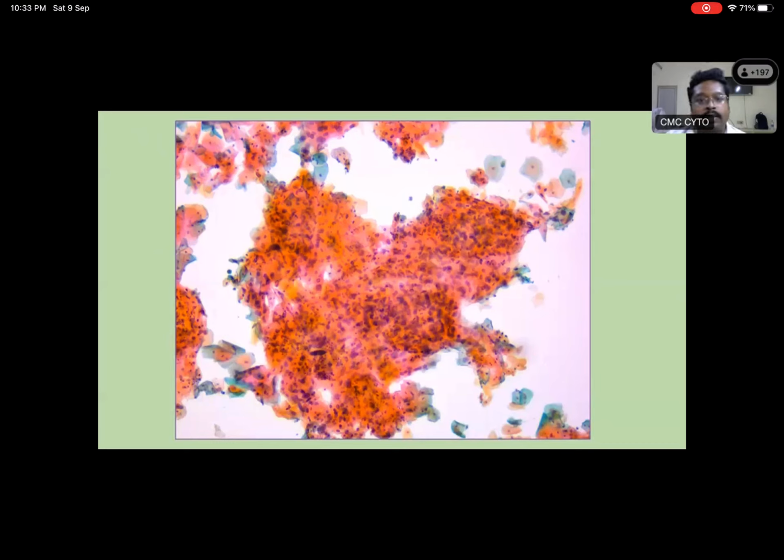Shelly then? Yes, sir. Yeah, you want to describe this one? This, sir, is from a 50 years female with bleeding per vagina. Sir, in this cluster, we can see hyperkeratin. The keratin is increased in the cells because it is orangeophilic, but the nucleus is intact. So it could be parakeratosis. Okay. Do you think you will get so much clumping and hyperchromasia in parakeratosis?